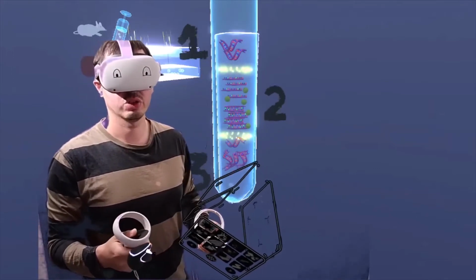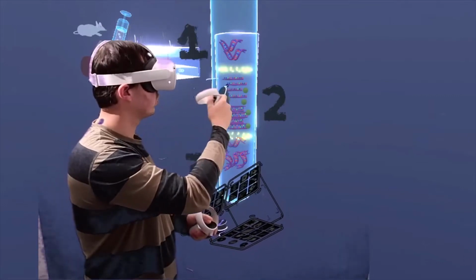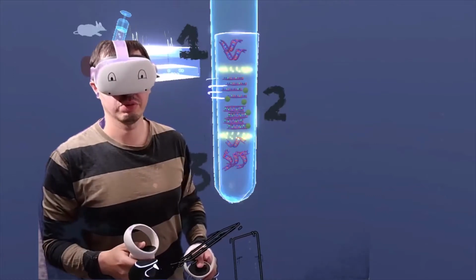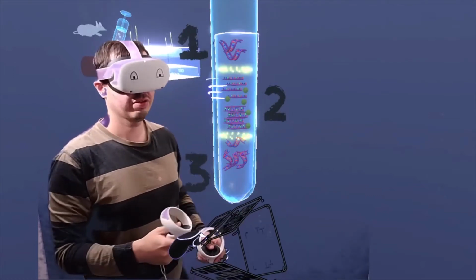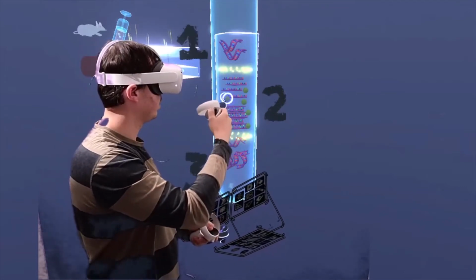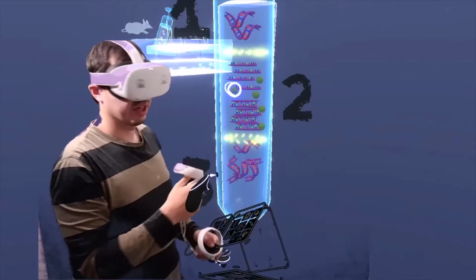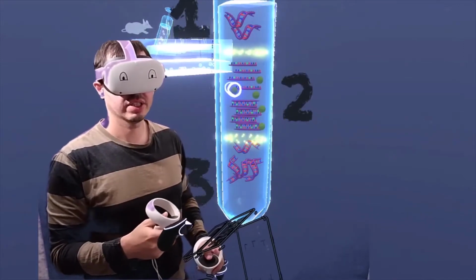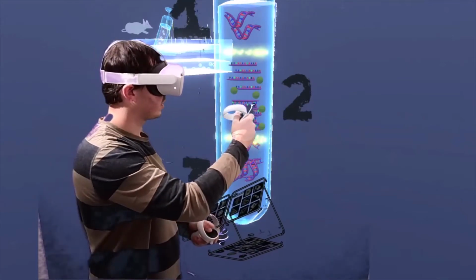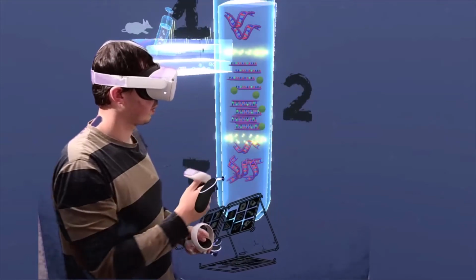When you heat the tube, you separate the strands. So you get 1, 2, 3, 4. These strands are now open for the polymerase reaction to happen. You have DNA polymerases here as these little dots. They're going to use the nucleotides inside the reaction medium to fill in the blanks, to complete the strands that have been left open.